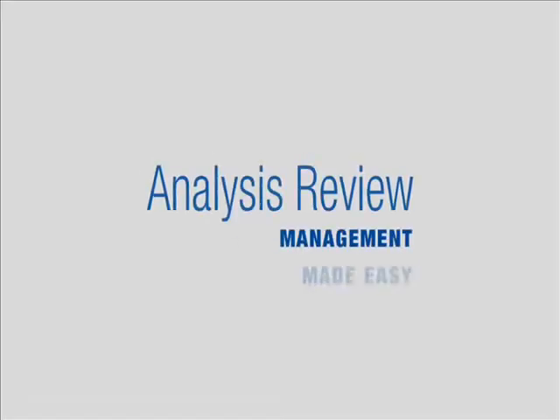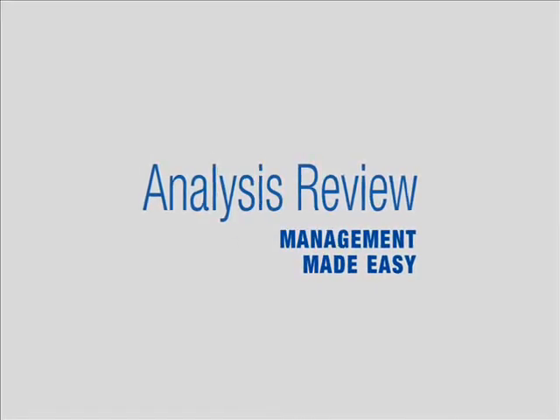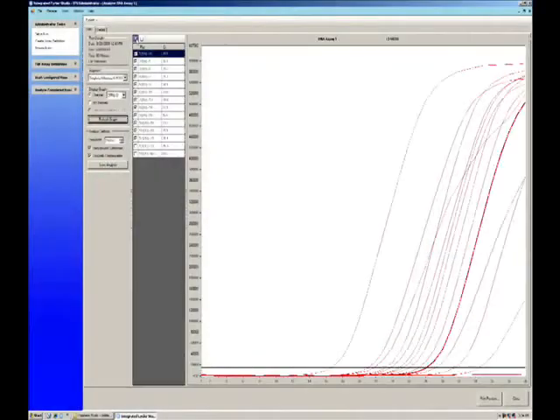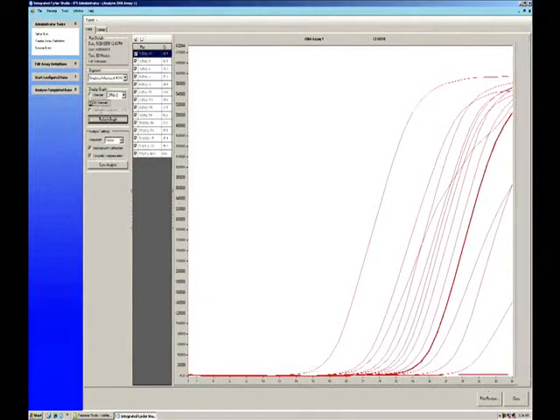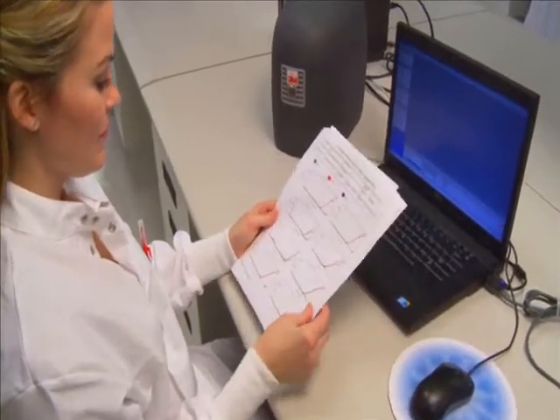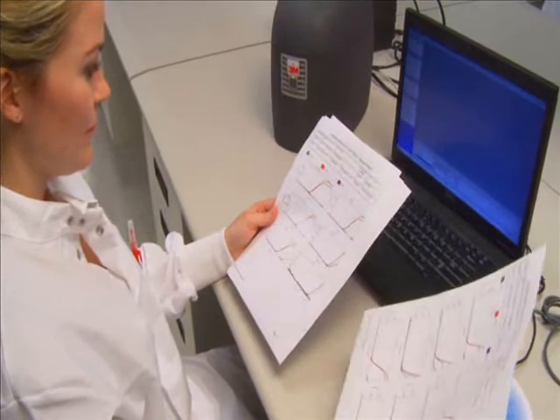With Integrated Cycler Studio software, you can choose to view individual amplification curves in real time and even start a new run while viewing previous run results. For analysis, select your completed run and open the analysis screen. You can view or print color printouts with or without graphs for easy reviewing, or download the analysis directly to LIS.